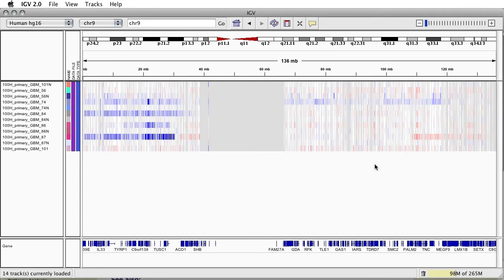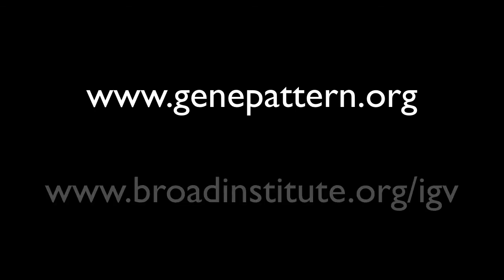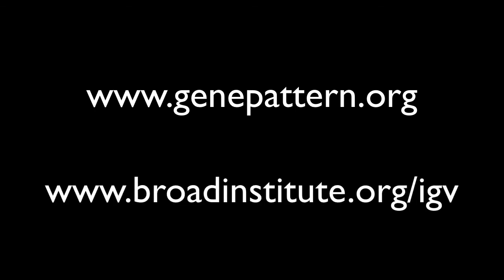As originally stated, this tutorial merely scratches the surface of IGV's capabilities, but hopefully has provided you with some basic tools for beginning to harness the power of IGV for the viewing of your data through GenePattern. More information about GenePattern can be found at GenePattern.org. More information about IGV can be found at BroadInstitute.org/IGV.